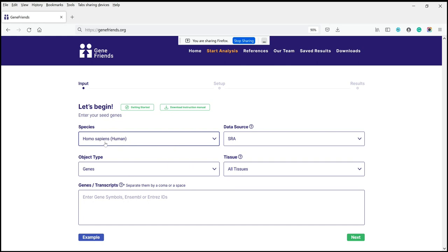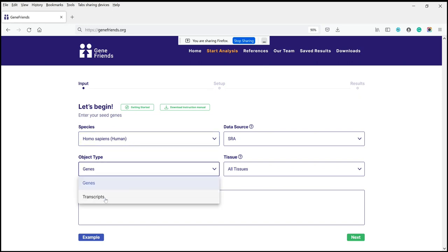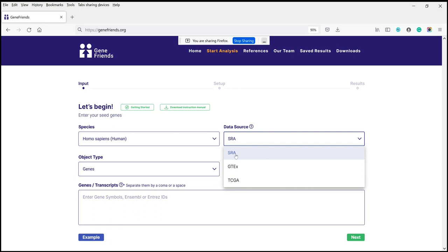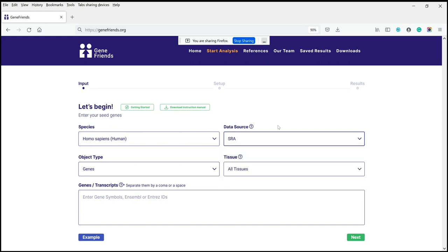Let's look a little bit more at humans and human data. As I mentioned, there are genes and transcripts, and there are different data sources. SRA stands for Short Read Archive, which is the main data source used for building GeneFriends. In addition to SRA, we also have GTEx data and TCGA data, which you can use as additional data sources. The most popular and widely used data source, and also the biggest, is SRA.